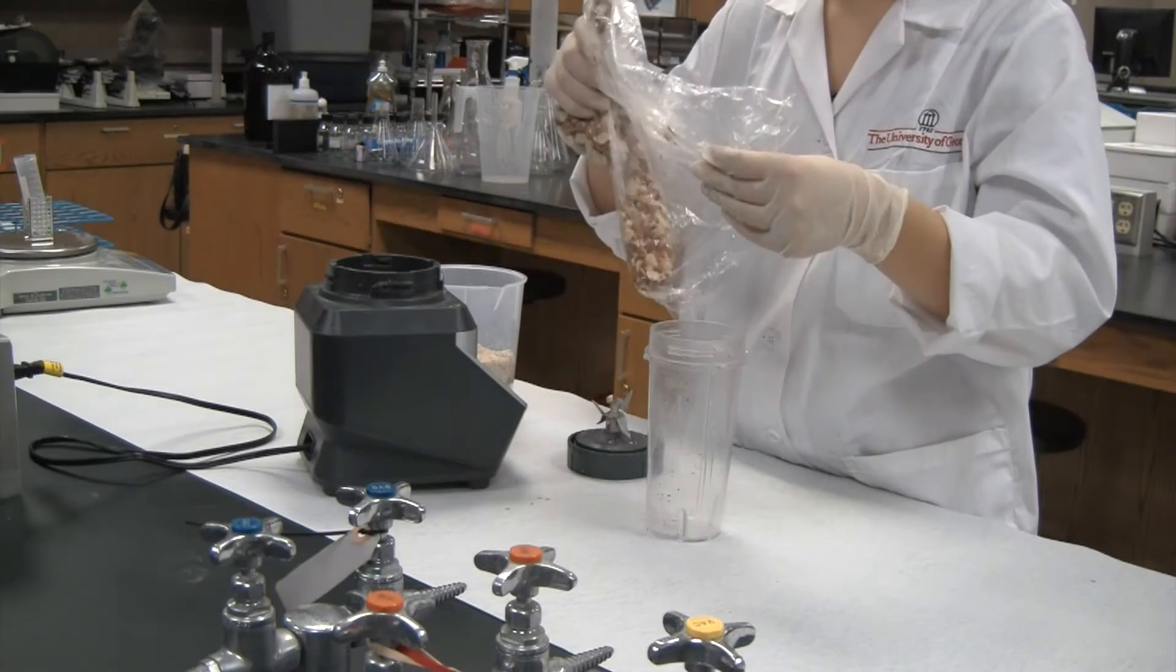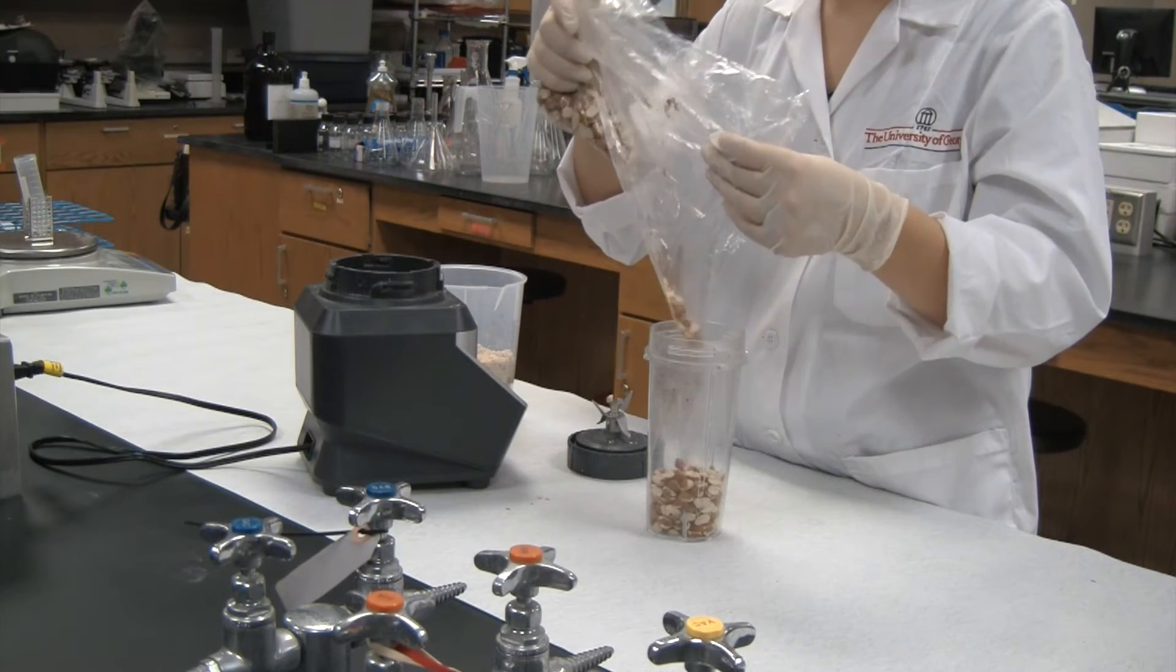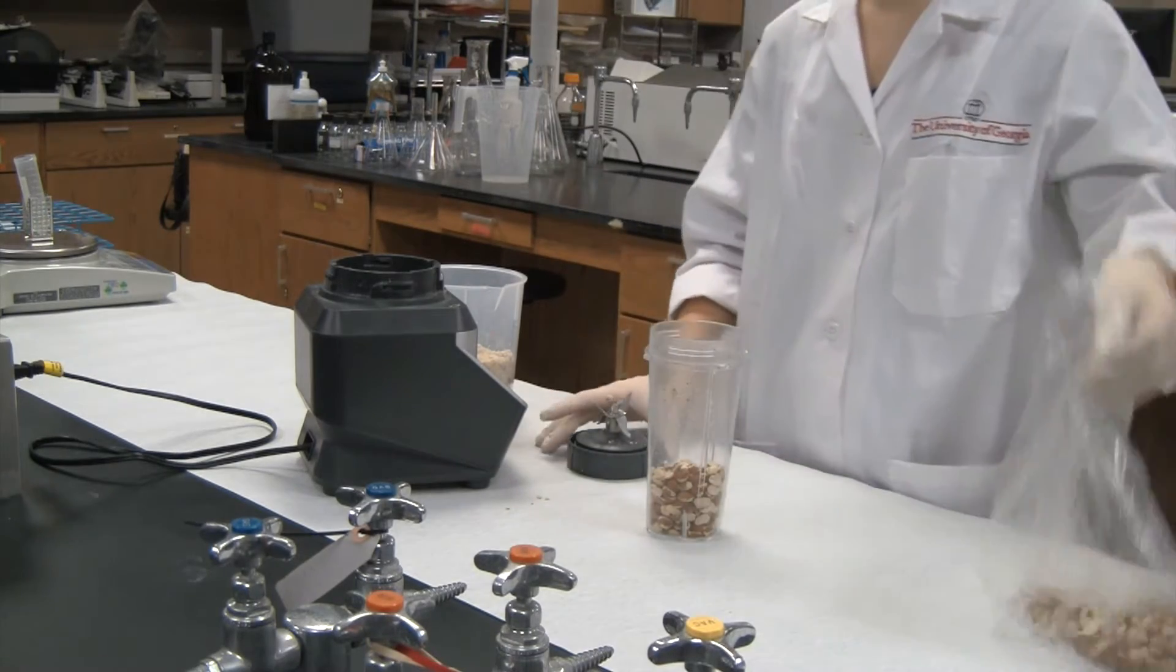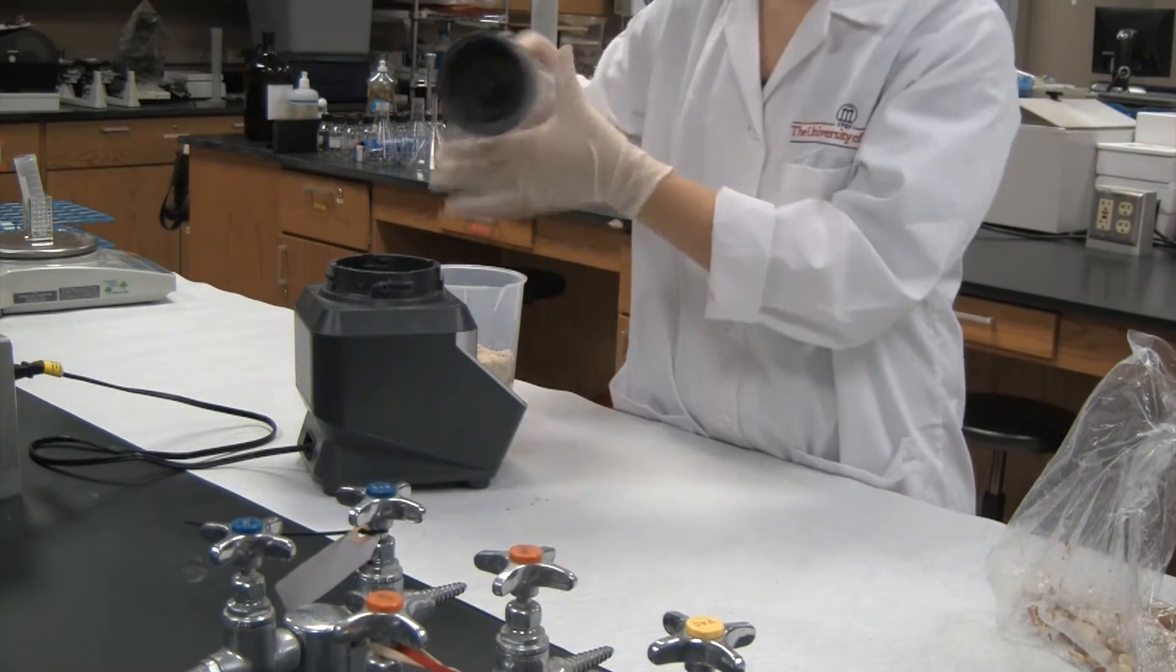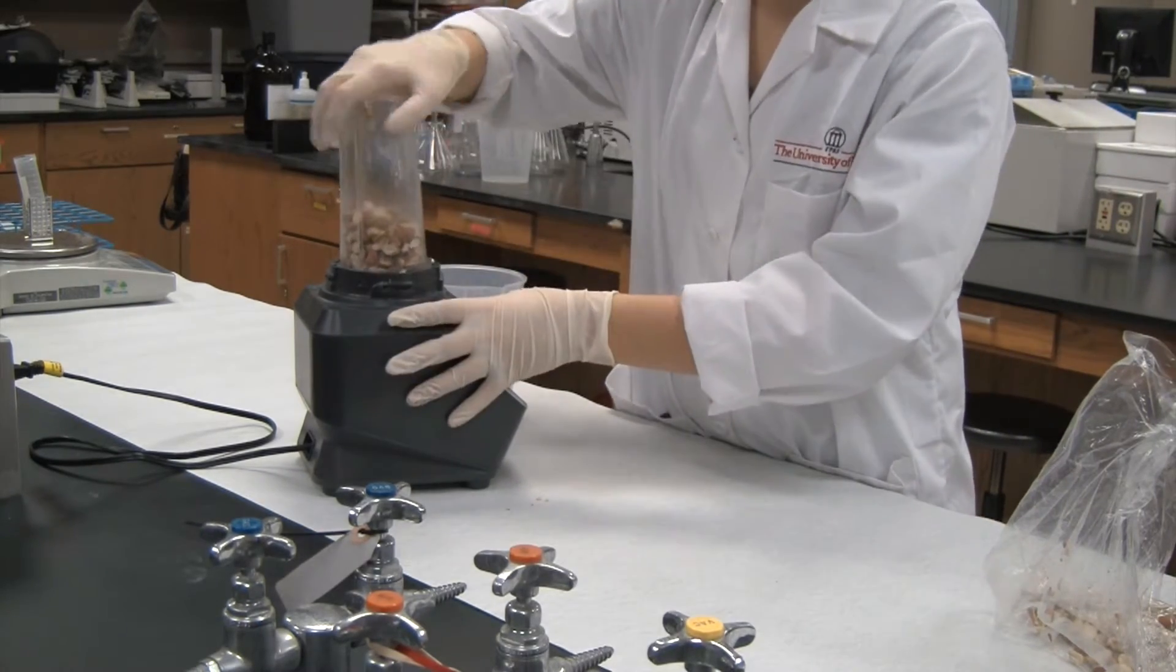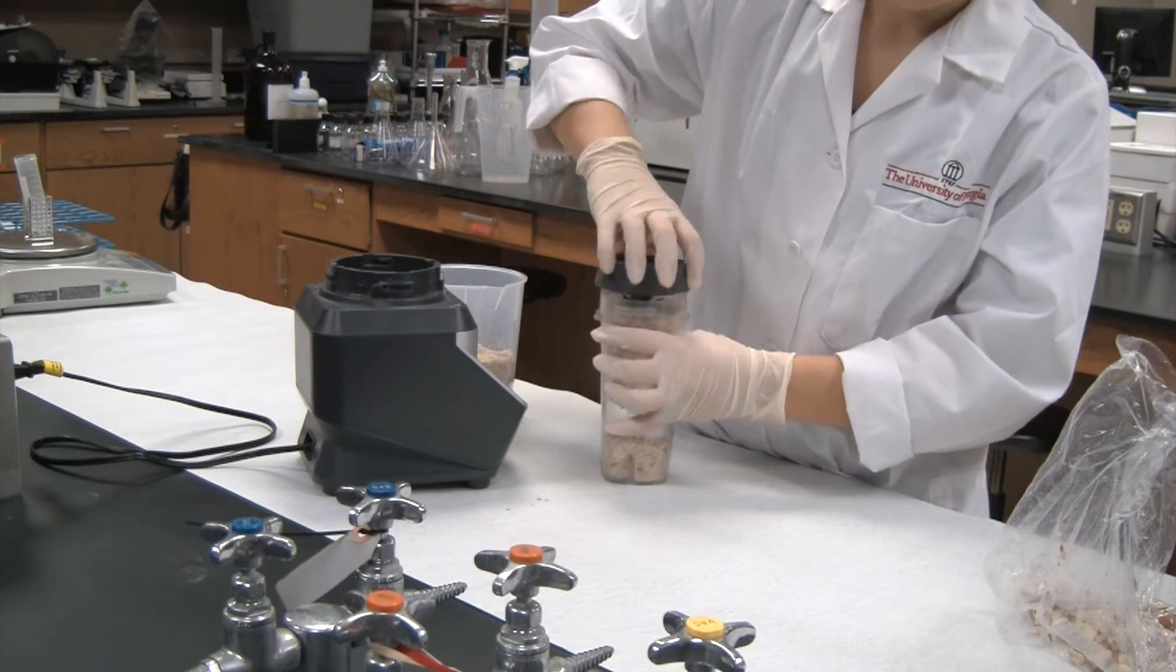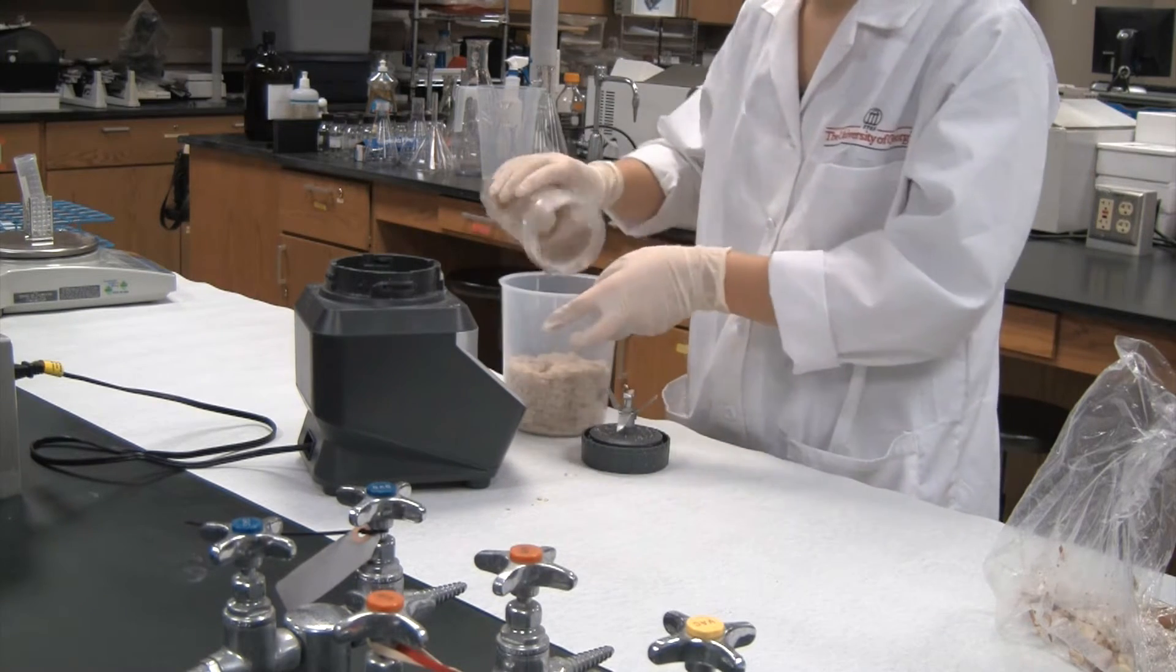Now, let's get started. First, the ground nut sample must be ground to a fine particle size. Be sure to grind the entire sample. Sampling technique and adequate sample size are very important to assure accurate results. A manual grinder can be used as long as the particle size is consistent and very fine. Here, we use an electric blender and several small batches to grind the entire sample.